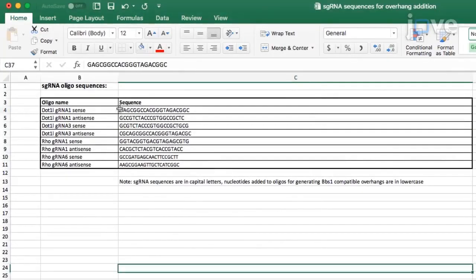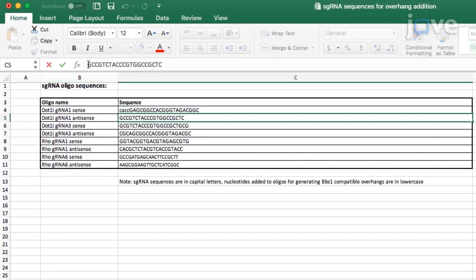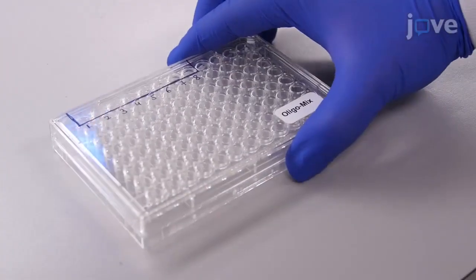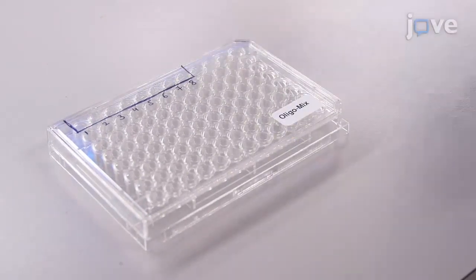For cloning in the desired single-guide RNA expression plasmid, prepend the nucleotides CACC to the sense oligonucleotide and AAAC to the reverse complementary antisense oligonucleotide. Premixed sense and antisense oligonucleotides are then ordered from a company in a 96-well plate labeled oligomix.